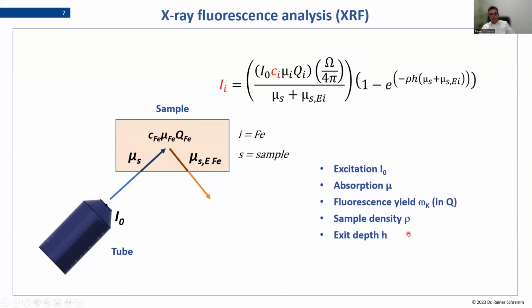So how deep we can look into your sample. And this also will define whether your sample is thick enough for the analysis, or whether the intensity will increase with increasing thickness of your sample. So these are very critical parameters. We have to talk more about them on the next slides.